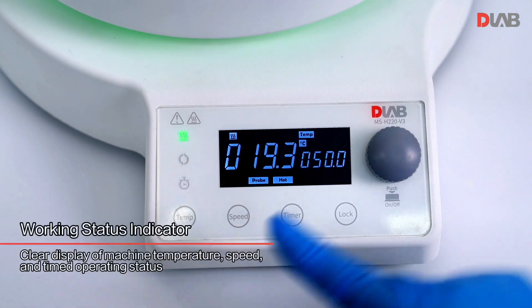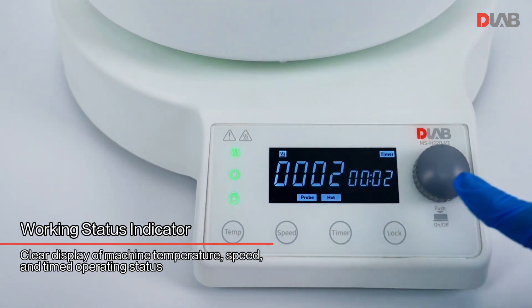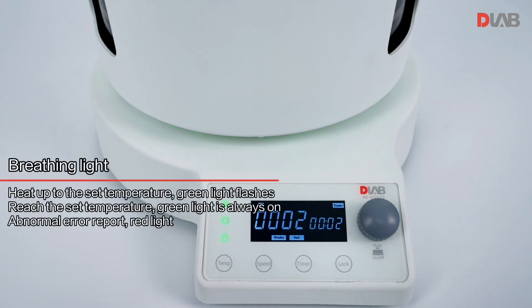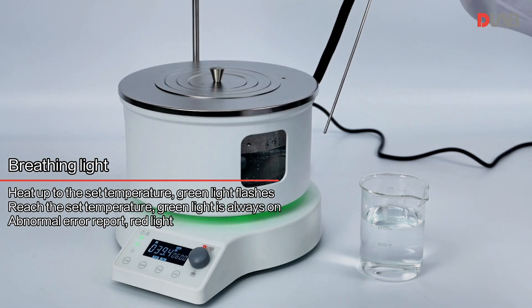Working status indicator: clear display of machine temperature, speed, and timed operating status. Breathing light function — when heating up to the set temperature, the green light flashes. Once the set temperature is reached, the green light is always on. For abnormal error reports, the red light activates.